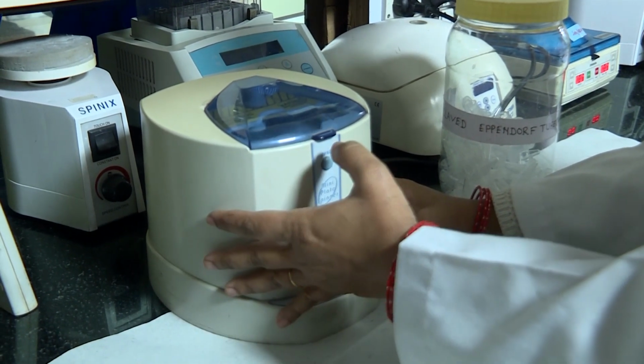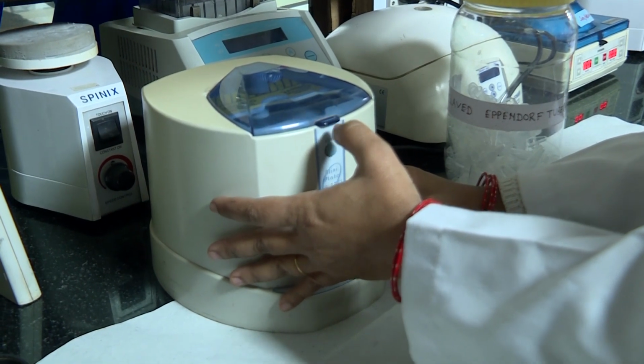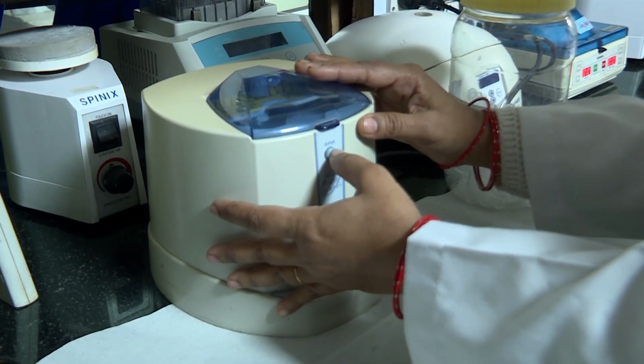Now your reaction is ready. Now we will put this plate in the machine, set the program and run, just like PCR.